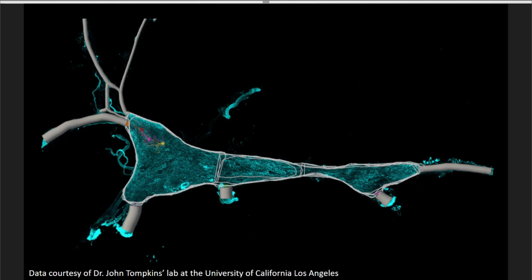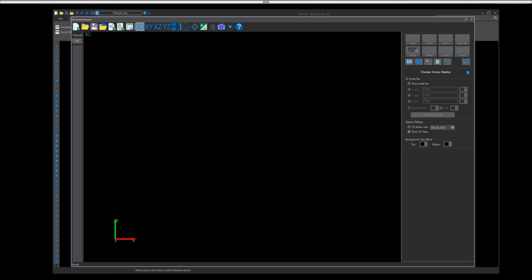These anatomies can also be surfaced on the SPARC portal using the scaffold viewer to help communicate the specific terms to the portal users. So let's dive into how the Tompkins lab makes data files like this one FAIR using Neurolucida 360's connection to the SciCrunch terminology database. Take it away, Macy. Thanks, Aiden.